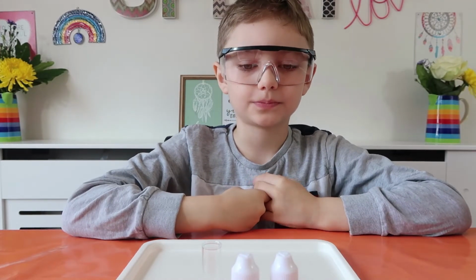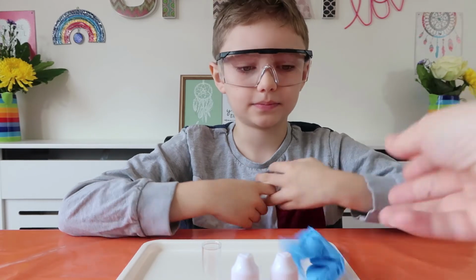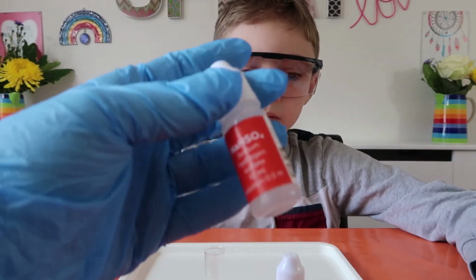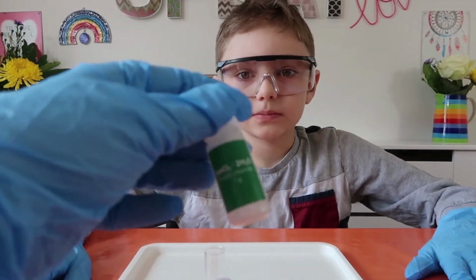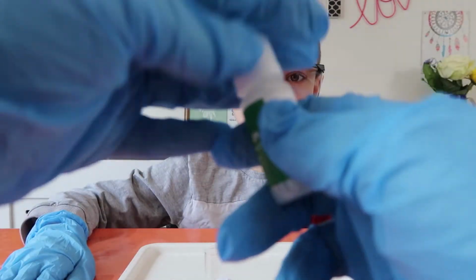Okay, so we've got everything ready for our experiment, haven't we? Our tin hedgehog. Yep. So here you go, Oscar. Here's some small gloves for you. Thank you. I'll pop some gloves on too. You need this bottle here of sodium hydrogen sulfate, and you're going to pour this into this tin chloride, okay? So let's open this up.